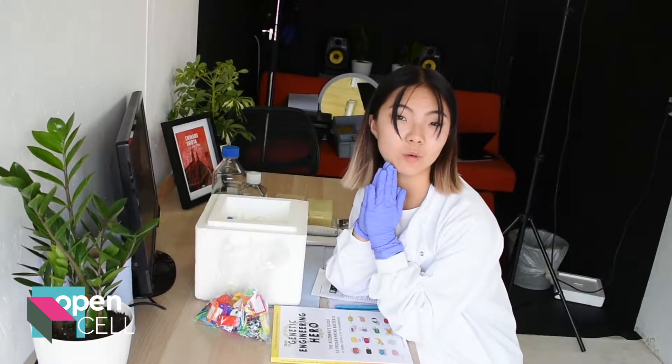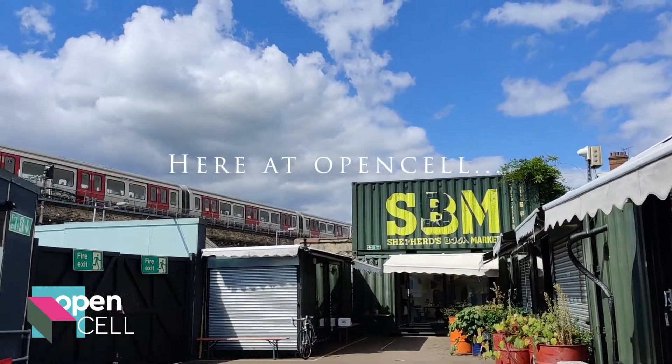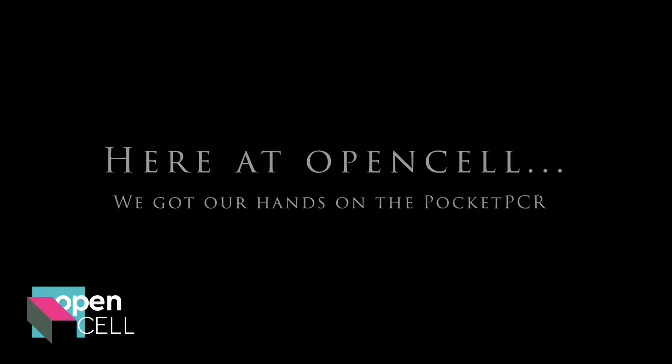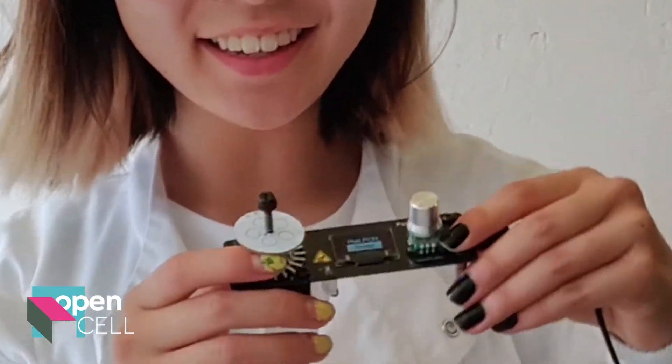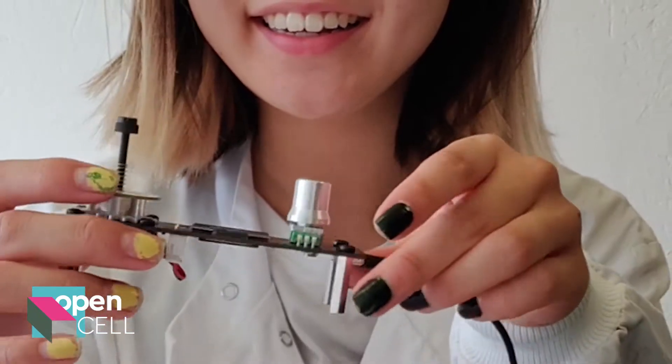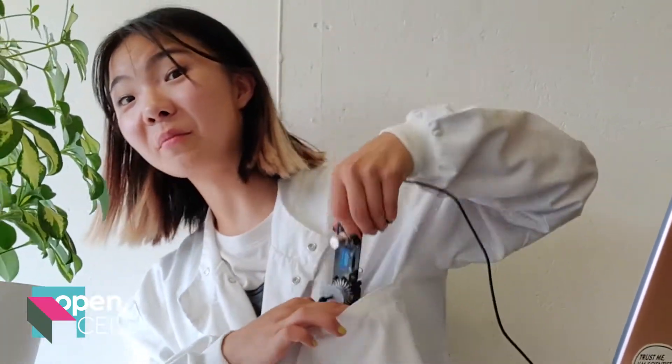Hi, do you need more jeans? Well hello there, my name is Lucy and this is the pocket PCR. It runs PCR reactions from your pocket.